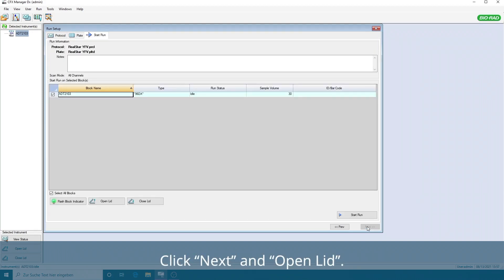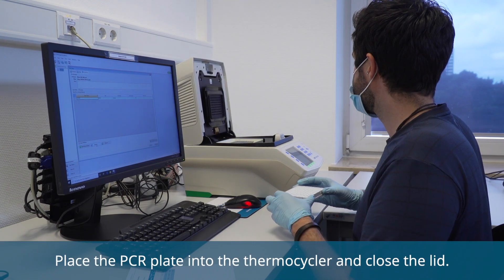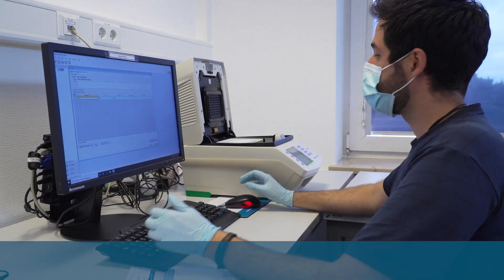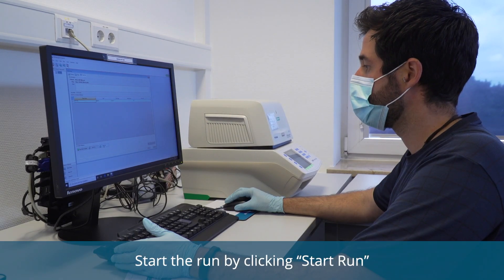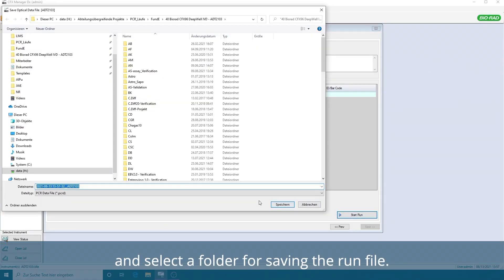Click Next and Open Lid. Place the PCR plate into the thermocycler and close the lid. Click Close Lid and wait until the lid is fully closed. Start the run by clicking Start Run and select a folder for saving the run file.